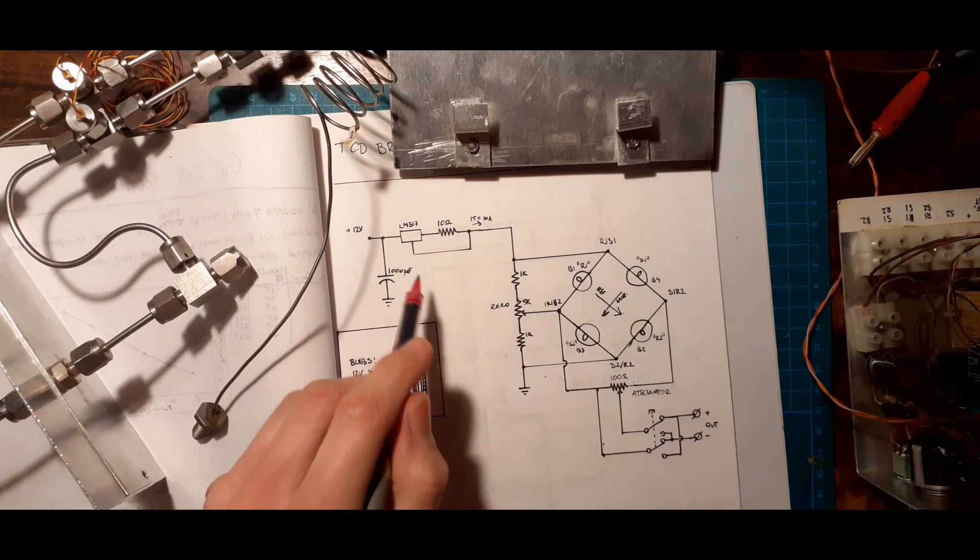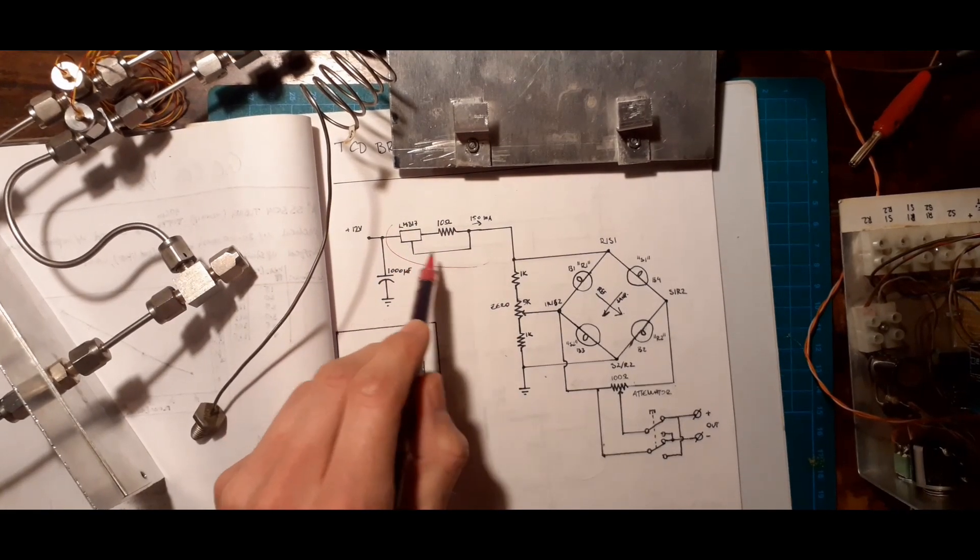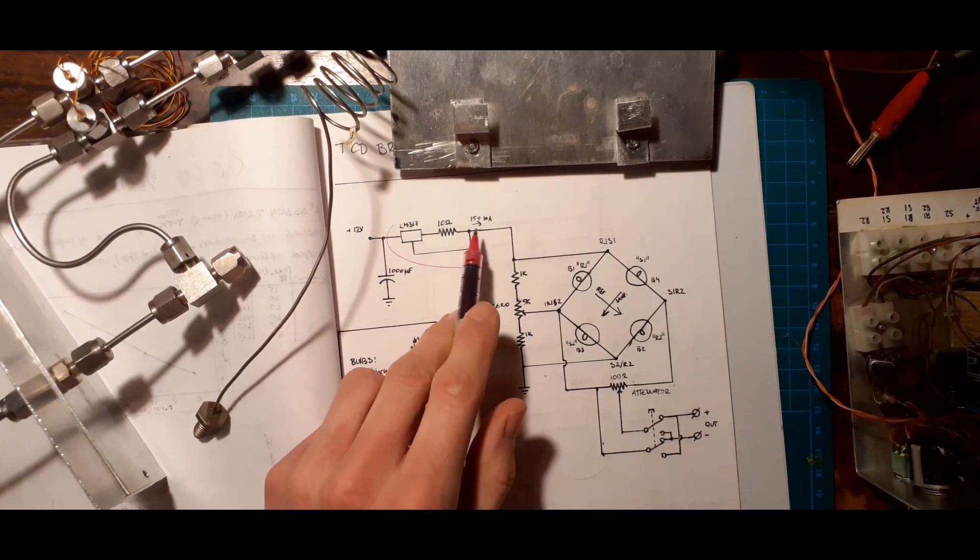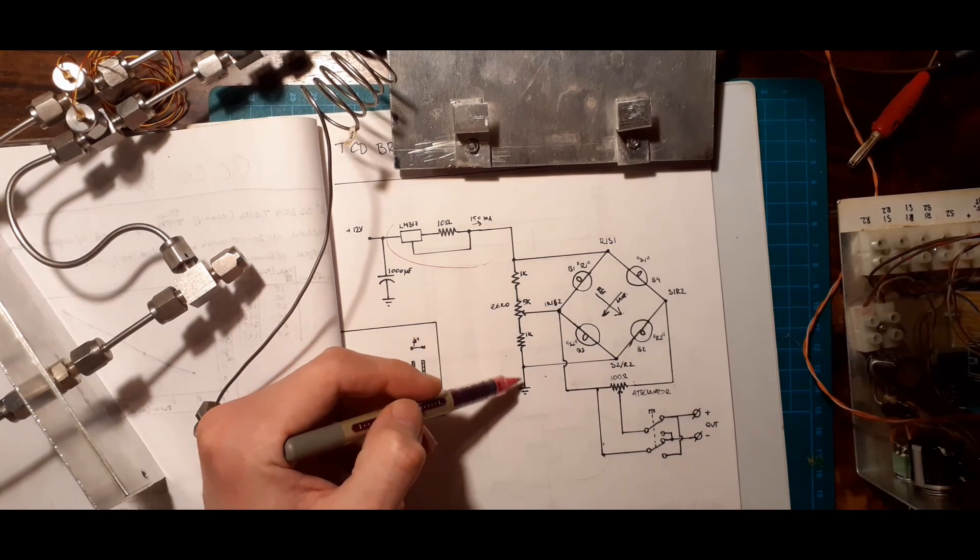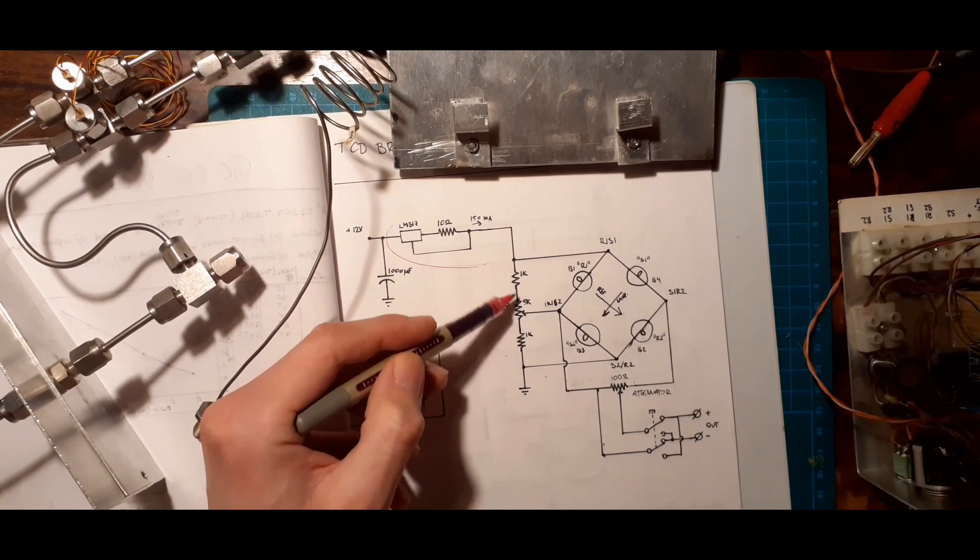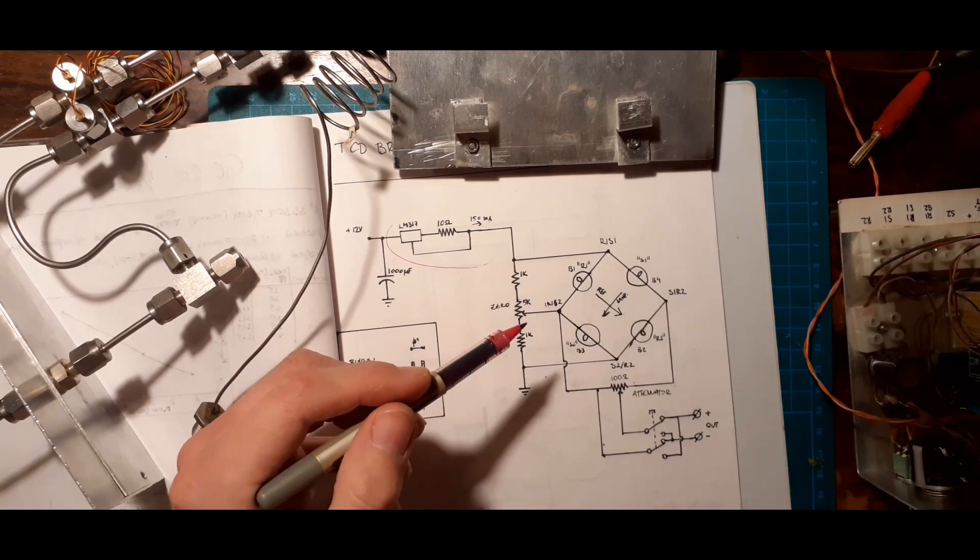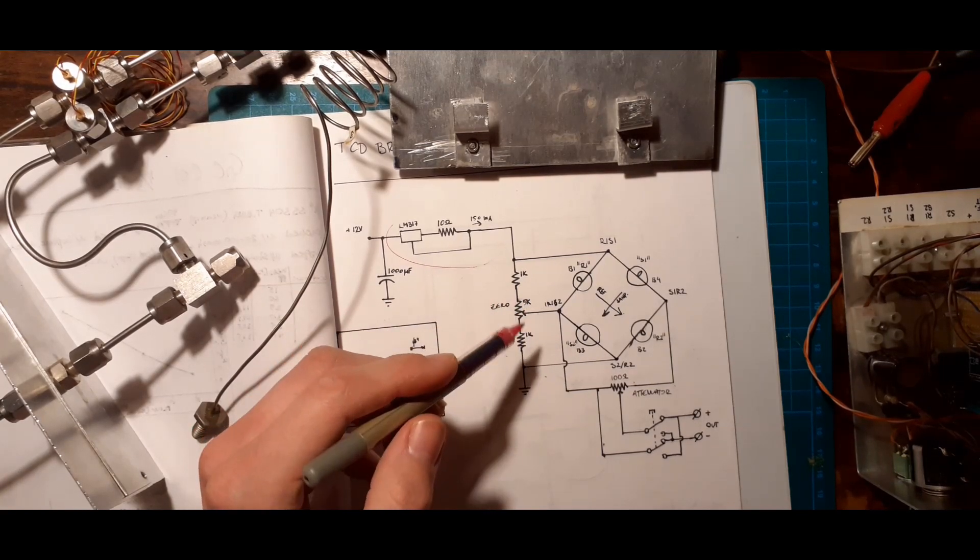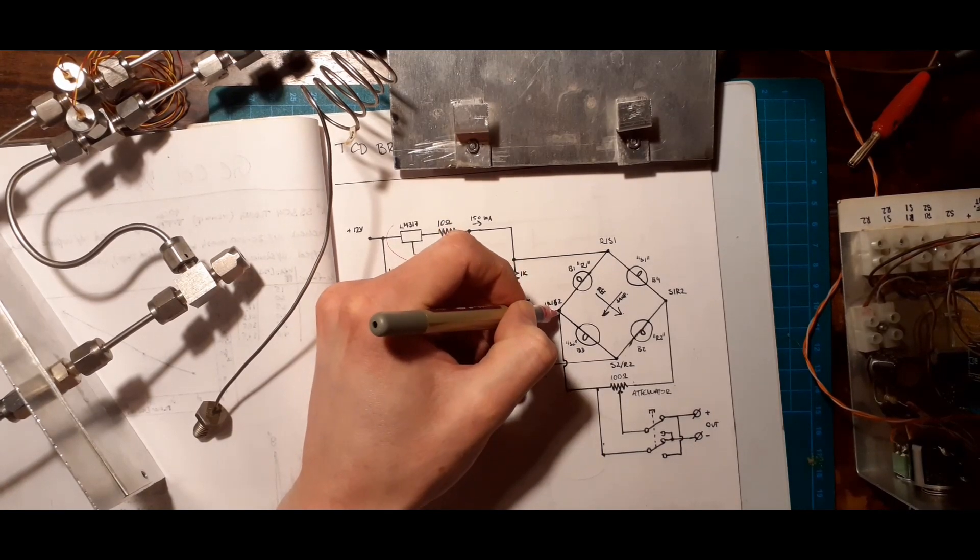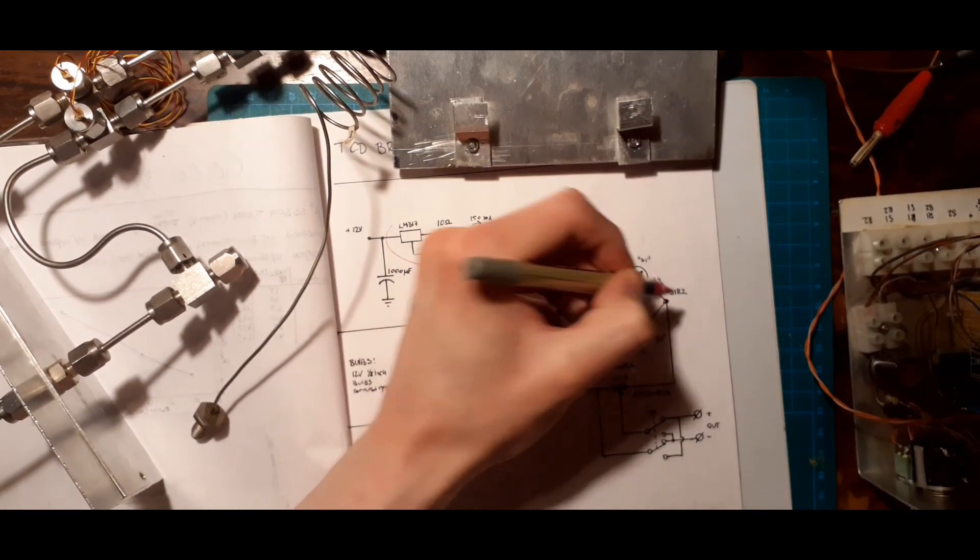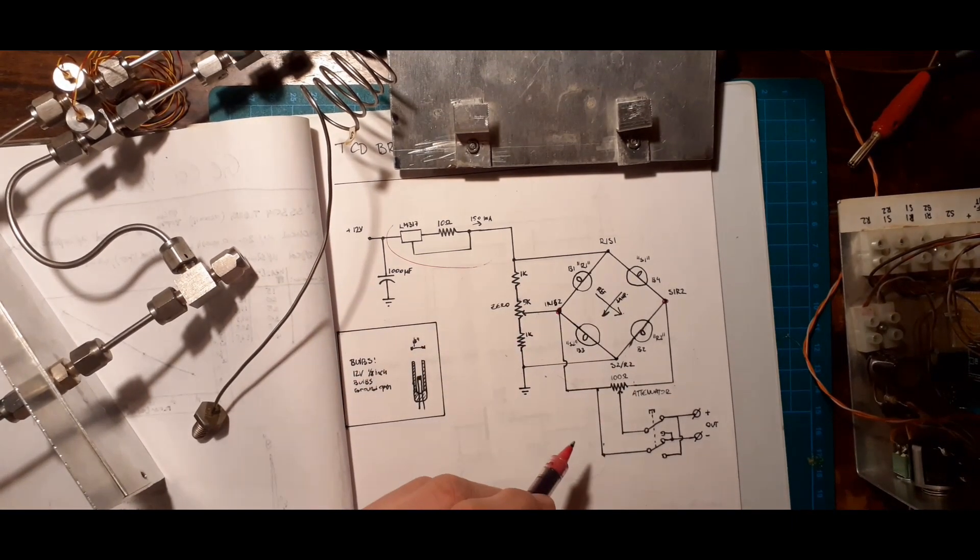Additional circuitry is a constant current source here. This is just an LM317 set up for 150 milliamps. That's about maximum for these bulbs. Then there is a potentiometer here, which sets the zero. It's of course important that you can null this out, so you get a zero difference. What you're really measuring is the difference in voltage between these two points, and you get a differential signal out of that.